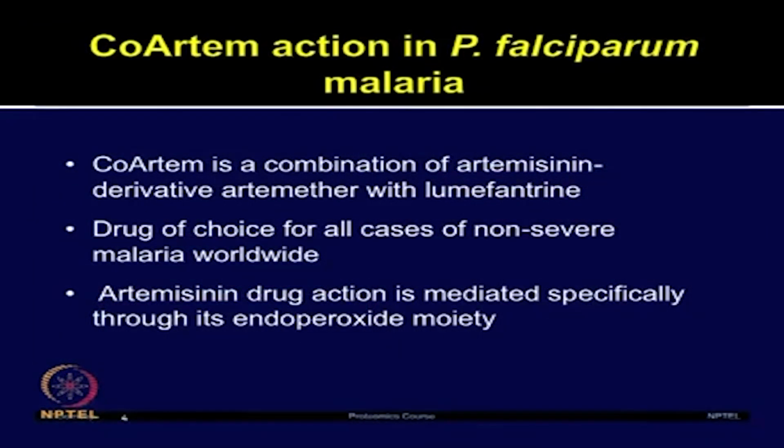In this paper, authors have discussed how two different drugs which are effective anti-malarials can be studied for looking at the proteome changes in the Plasmodium falciparum parasite. Coartem is a combination of artemisinin-derived artemether with lumefantrine.